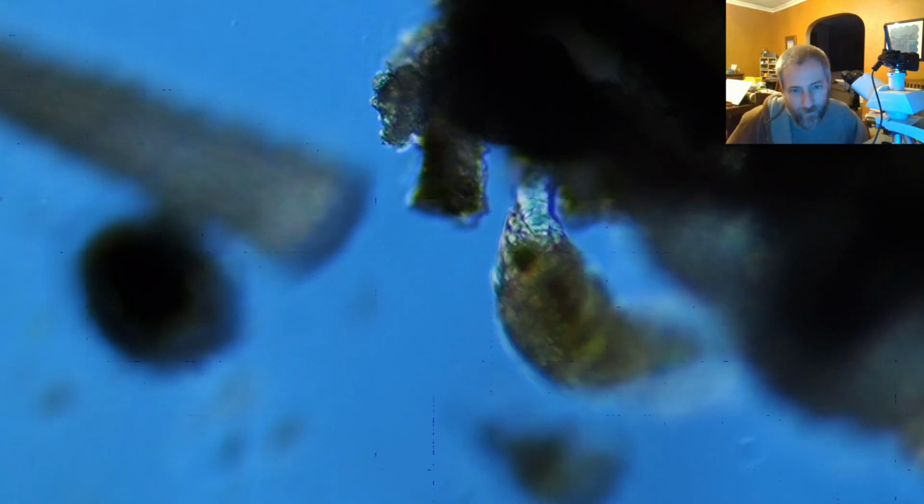There's a couple of rotifers right there, side by side, and then another one over here. You can see the sort of green internal body component to them right there, which is you're looking into their stomach. That's what they've been eating, which is this algae. They either pick it up off of the surface, or they just spin those little cilia around their face and draw stuff in towards their mouths. And then, as I mentioned, they can reject stuff or accept it and then chew it up and then down the hatch.